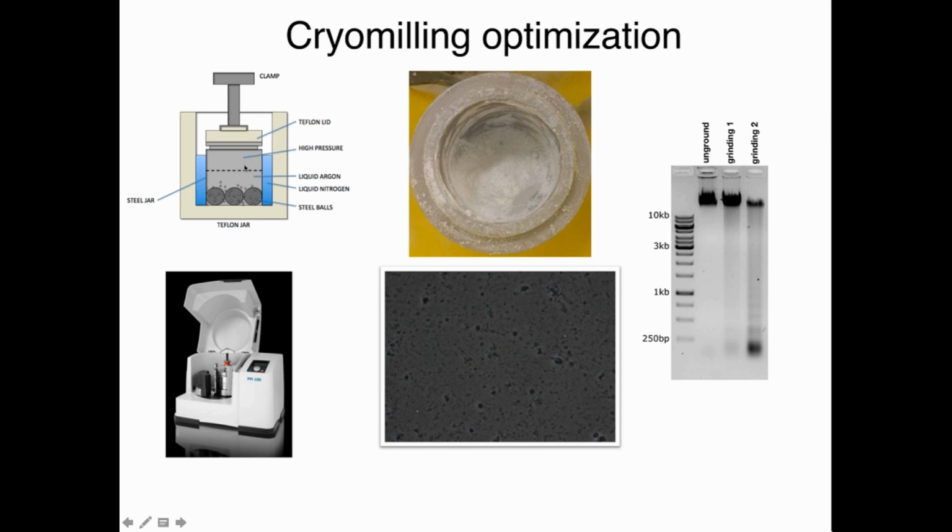And we put this into this machine here, which is a shaker, and it'll mill in multiple cycles for long periods of time. And up here in the center, you can see this metal jar with this white powder in there, and that previously contained these BBs of frozen cells that have undergone an extensive grinding process, forming this powder.